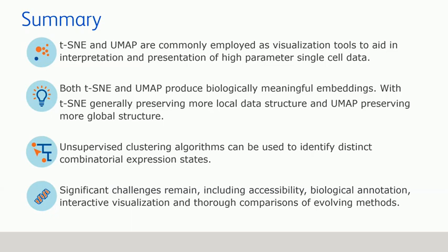While dimensionality reduction techniques like t-SNE or UMAP help us to visualize the data in a more intuitive way, clustering helps to make sense of these visualizations by identifying which cells are similar and belong in a group or population together. So again, in flow, these techniques are crucial for translating complex multidimensional data into actionable biological insights.